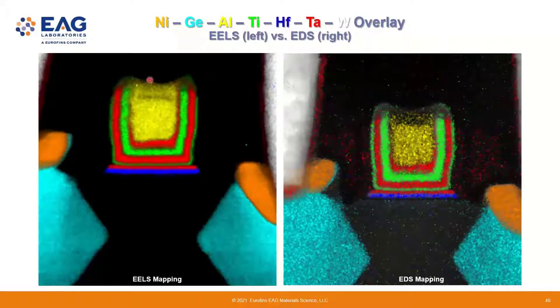So there are a lot of interesting elements involved in the fabrication. Actually, carbon is also somewhere here as the so-called low-K material, right? In the silicon transistor, you basically use the high-K for the tunneling gate, and you also use a low-K, or low kappa, to reduce the capacitance coupling between your metal contacts and between your devices. So there's a layer of carbon here I didn't show you, otherwise the map will be very busy.